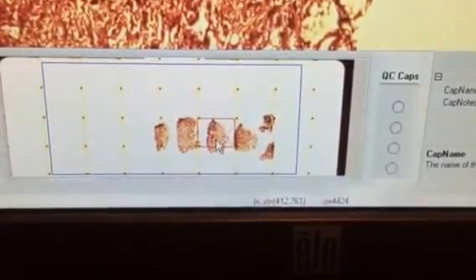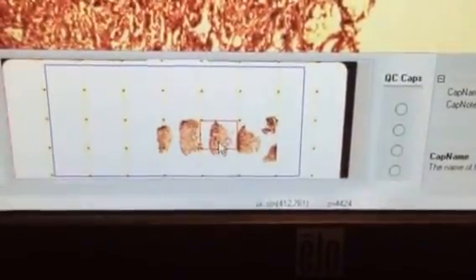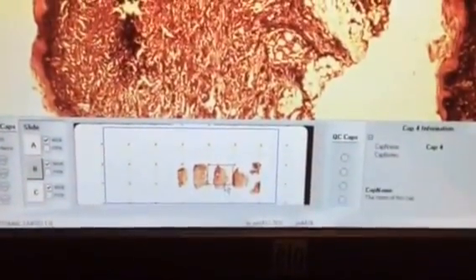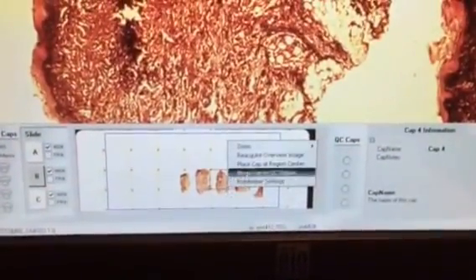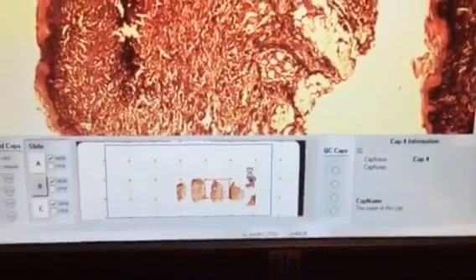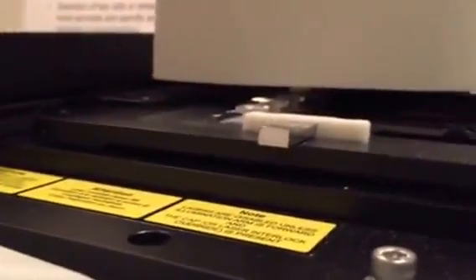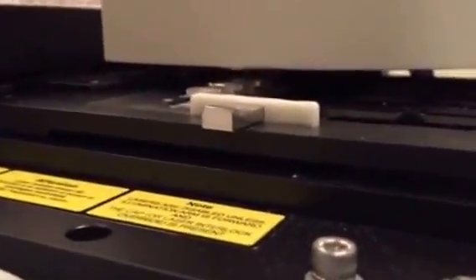Once you select the piece of tissue that you would like to extract via the overview image, you first have to put a cap on the slide. The system will go and pick up a cap and place it on the slide for our exact location that we chose.